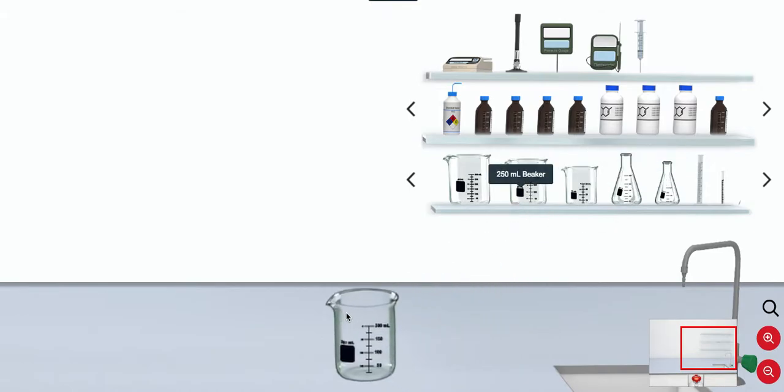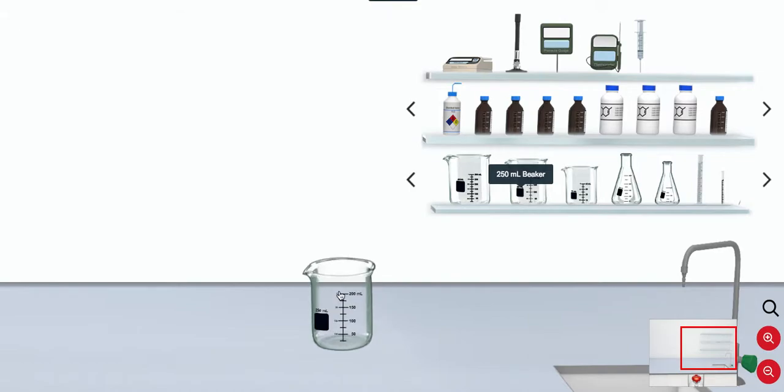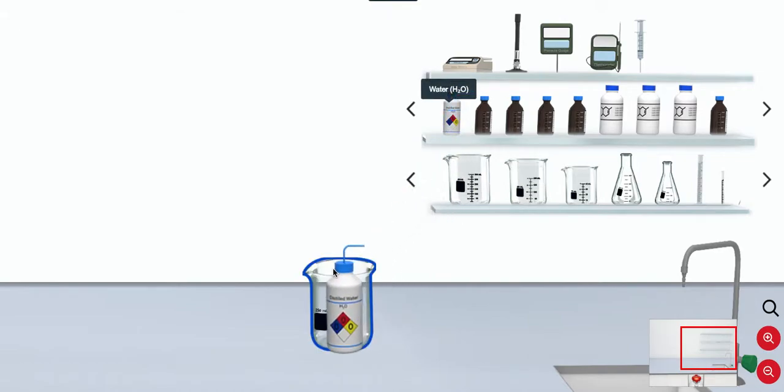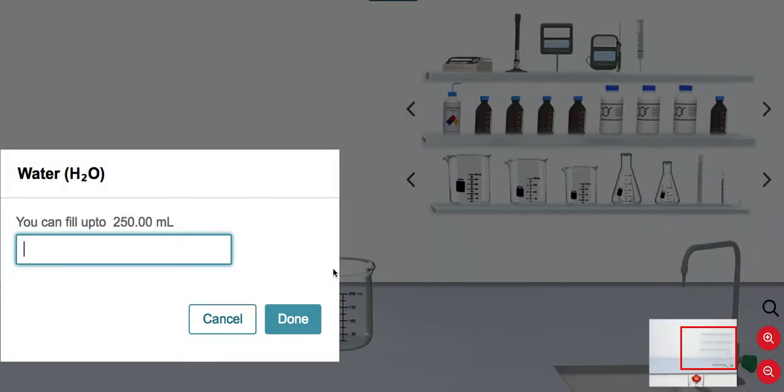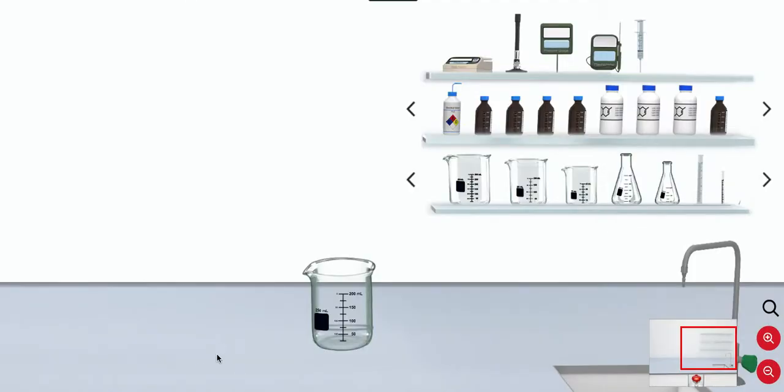But the click and drag functionality is still the same, which makes it easy for students to drag items to the bench top or add materials to containers.